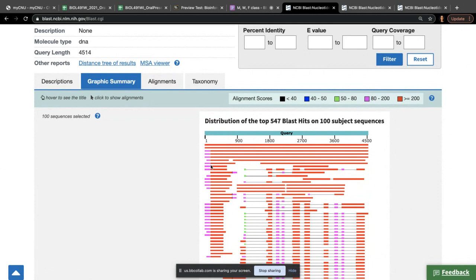So how do I know it's the same sequence? If you hover over and you stop, it will say predicted whatever E3 ubiquitin, and then I go over here, it's going to say the same thing. So this is one result. And then here's another gene. So that one was the E3 ubiquitin. And this one is the carboxylase gene from some other organism.